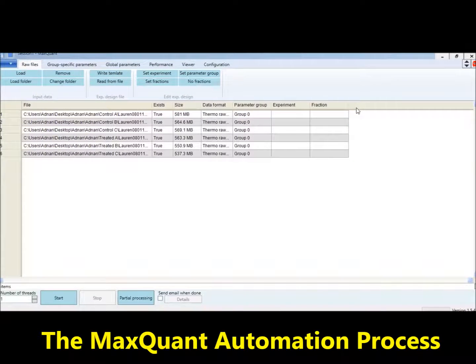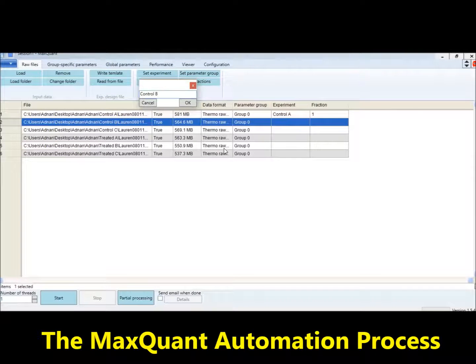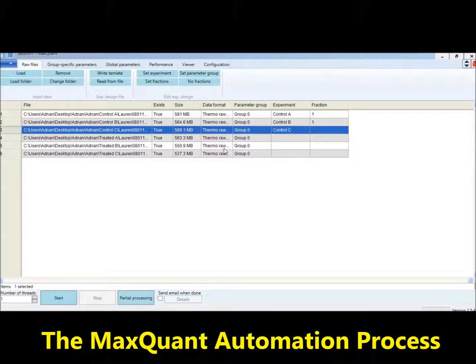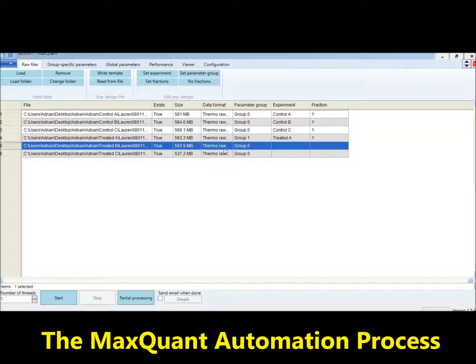What it does is enable label-free quantification, and then the minimum LFQ ratio count is given as 1. This represents the number of peptides to be considered for LFQ intensity calculation. Then it specifies the FASTA file against which MaxQuant will search for identification, and then it enables the match between runs option, which increases the number of peptides to be considered for identification. Then the identification and quantification process starts.